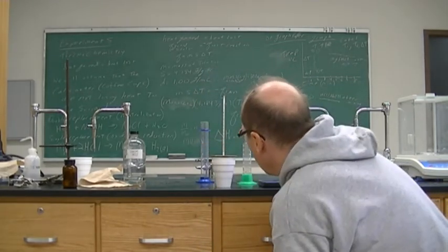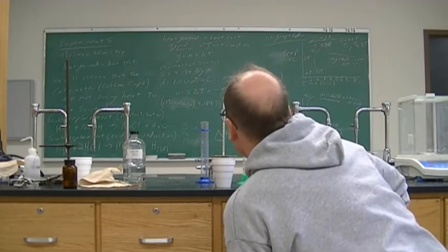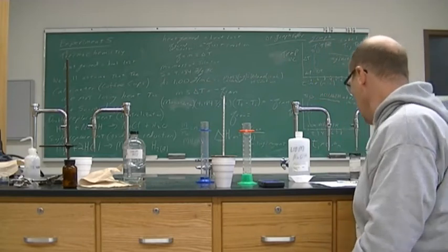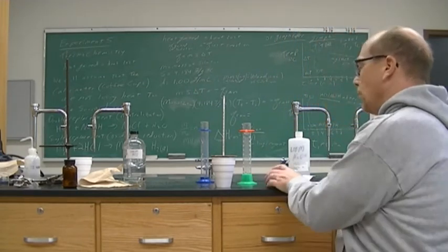All right, we're moving up to the 12-minute mark. 12-minute mark, we're still at 34.0. So not very exciting, 34.0 degrees Celsius. It hadn't changed from the 9 to 10 to 11 to 12 minutes. So, all right, that is it for data.